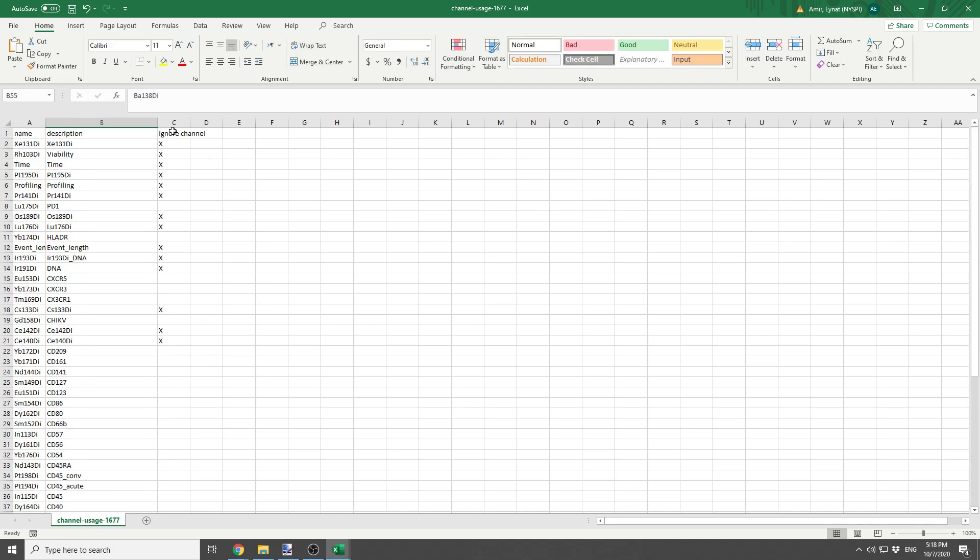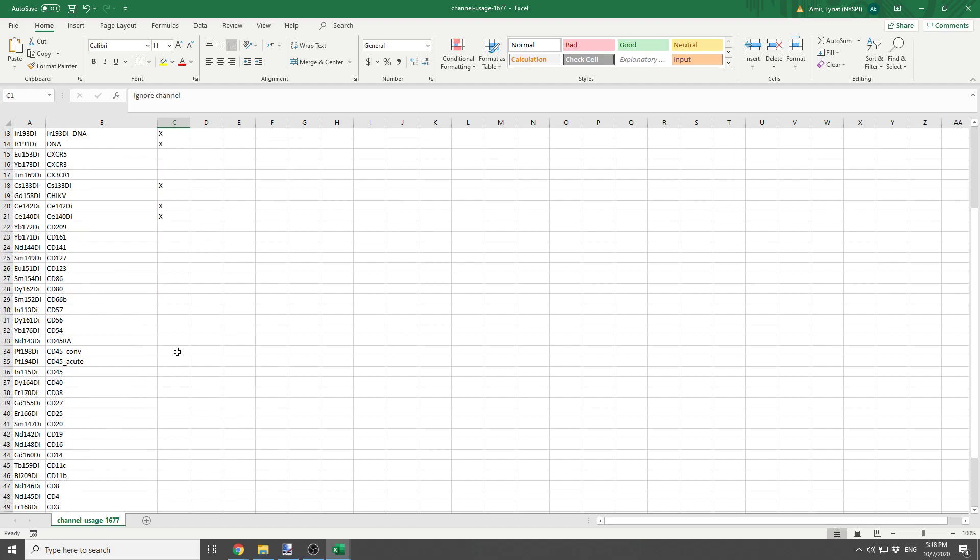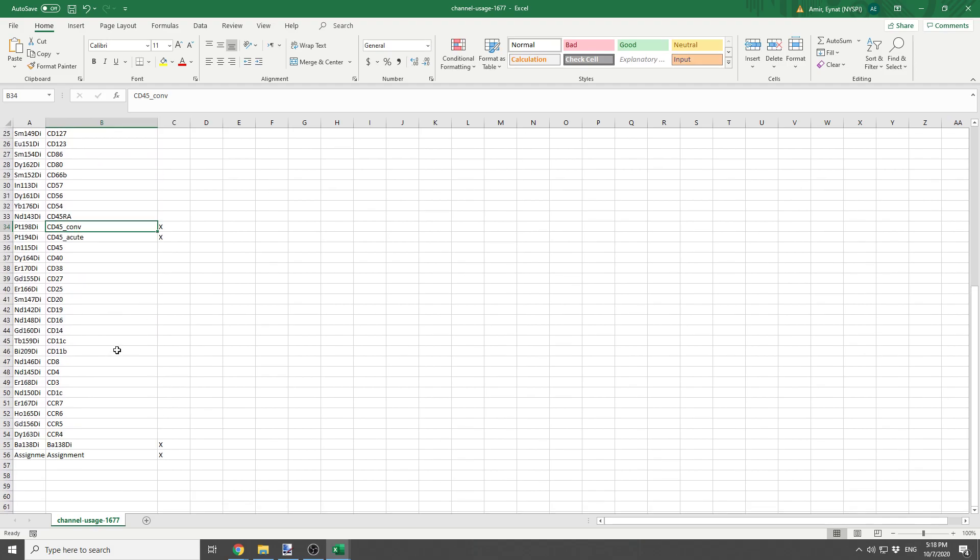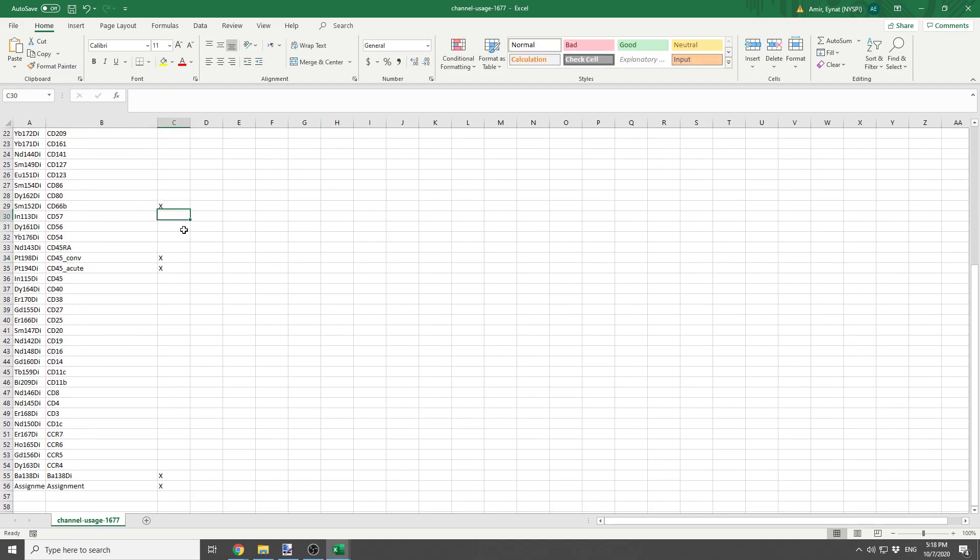Also, the third column is called Ignore Channel, and this means this channel is going to be ignored from the rest of the analysis. I'm going to use this opportunity to check off the two barcoding channels, and also CD66B, because this is PBMCs, so we don't expect that marker to be expressed.